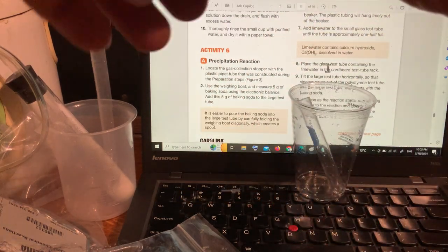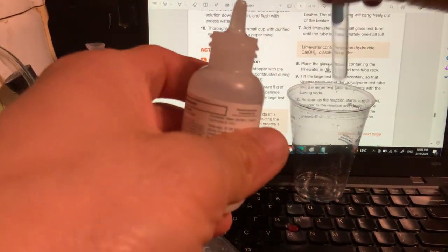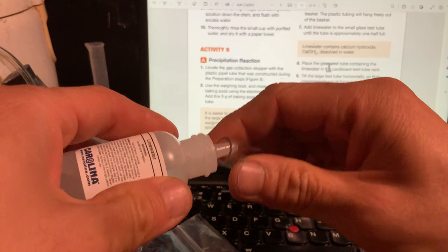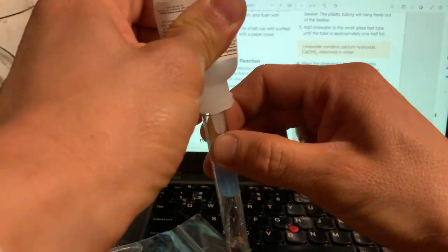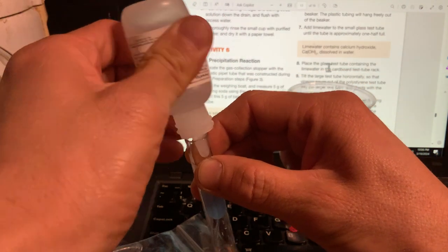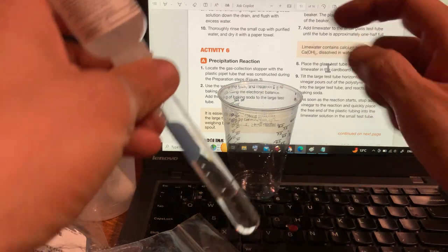It's very hard to see. I've tried this before for other classes, and it didn't work. So that's why I'm doing this. I want this to work. I'm going to fill this test tube with the lime water as directed in step 7. I'm going to make it half full.